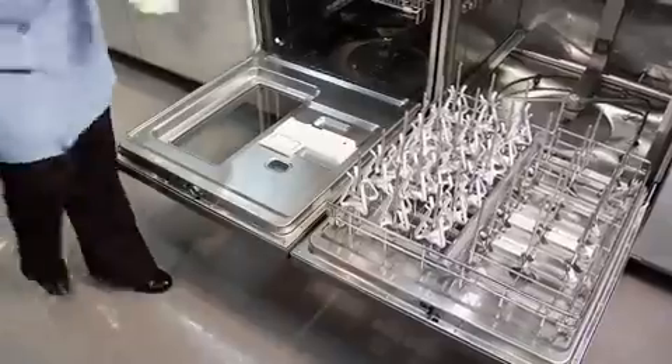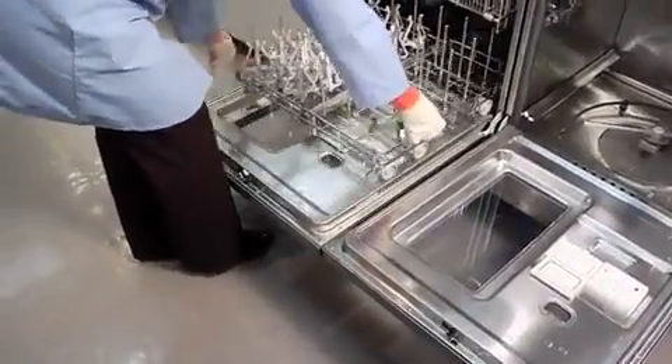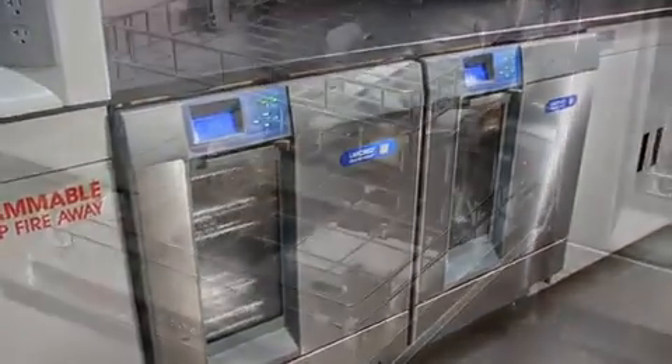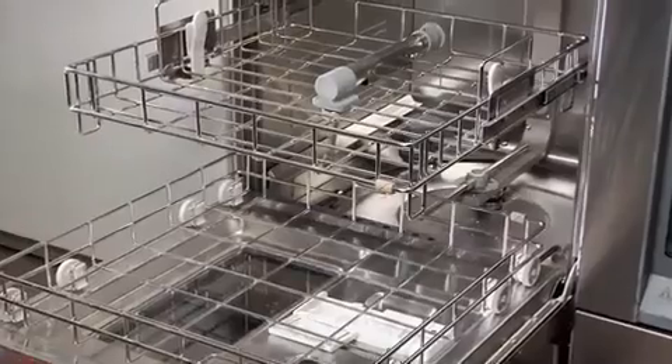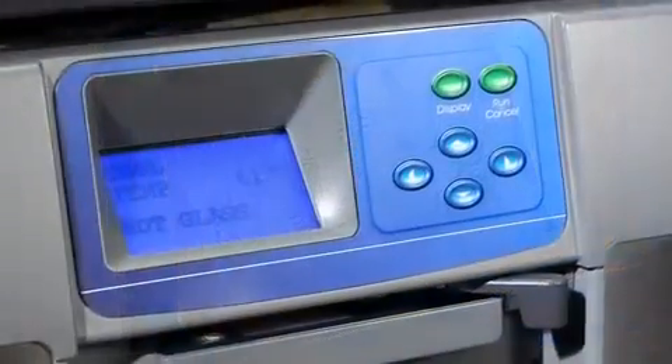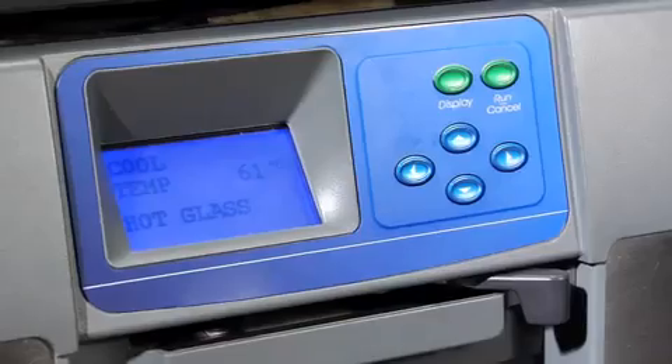Racks are interchangeable from spindle to standard in all three units. Standard features of the Steam Scrubber, Flask Scrubber, and Vantage include stainless steel construction inside and out for durability. An LCD keypad lets you easily customize cycles, monitor water temperature, and cycle progress.